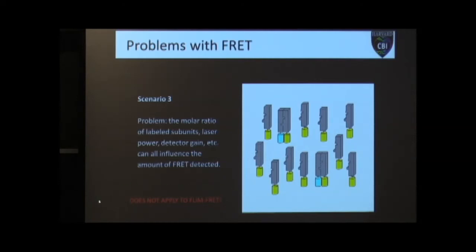The good news is these things do not apply to FLIM-FRET, because you're measuring an intrinsic characteristic of the fluorophore, its actual lifetime, and that is not going to change no matter how many of these molecules you have there or what kind of imbalance you have.